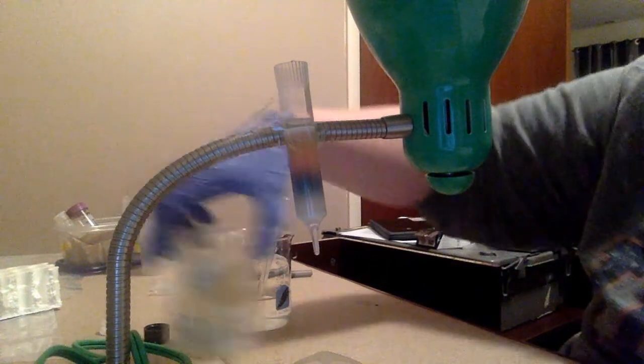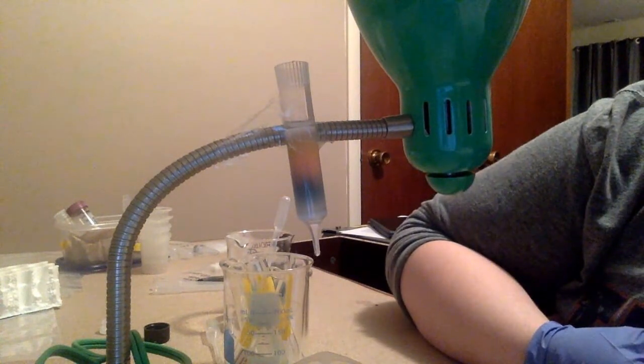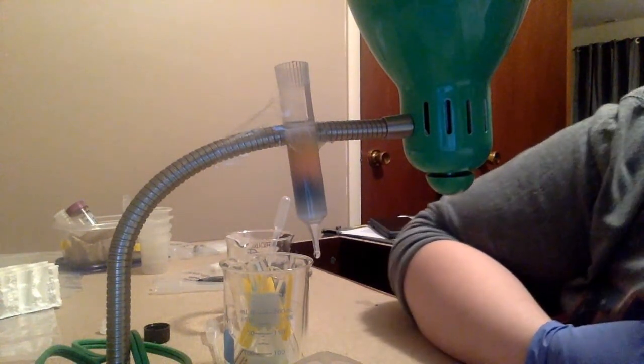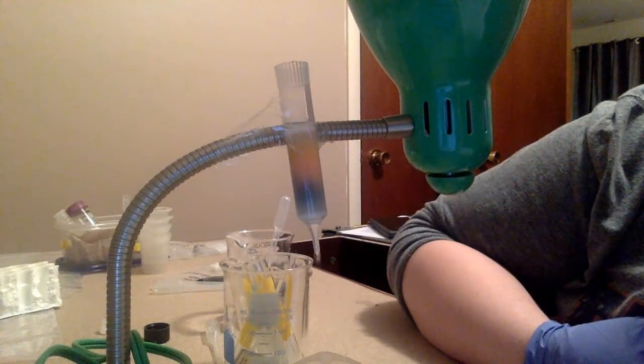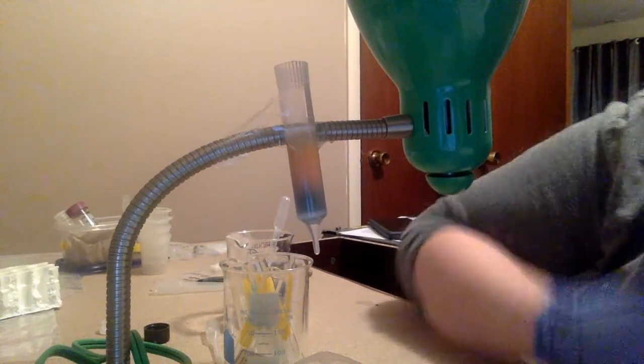collect the first color drop in a test tube, and I want to keep the colors as separate as I can. And the way that I can control what's coming out when is how quickly I put in liquid at the top. So I can kind of control the rate at which our liquid is moving through by how quickly I put things in at the top.